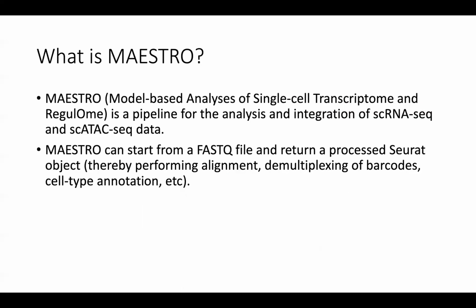And so, what is MAESTRO? Well, basically it's a comprehensive pipeline for the analysis and integration of either single cell RNA-seq or single cell ATAC-seq data.